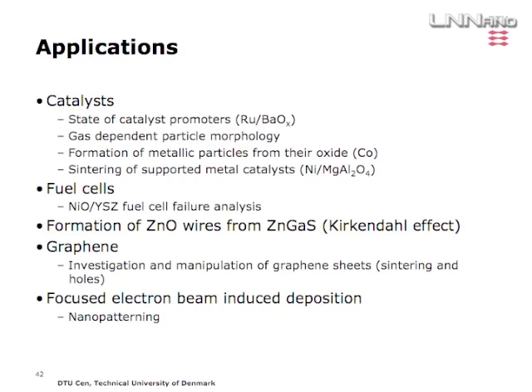So the examples I'm going to show you are going to revolve mainly around various aspects of catalysts and fuel cells, formation of zinc oxide wires from Kirkendall effects, and a couple of graphene stories, and then I'll get into this focused electron beam induced deposition as well, which is kind of nanopatterning, quite neat.